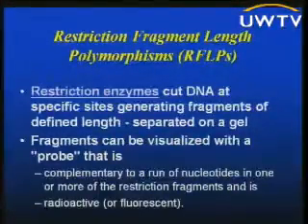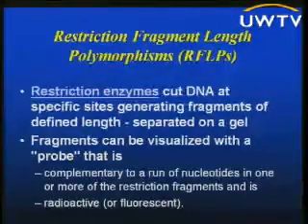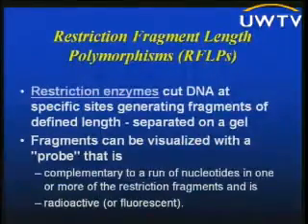So essentially what it is: genomic DNA collected from an individual. You use a specific restriction enzyme that cleaves this DNA to give you specific sized fragments that can be separated on a gel, and then you visualize these fragments using a probe or multiple probes. The probes, of course, are complementary to a certain sequence of DNA within these fragments, and the probes tended to be labeled in some way, either fluorescently labeled or radioactively labeled. It was radioactive to begin with and then fluorescent later.